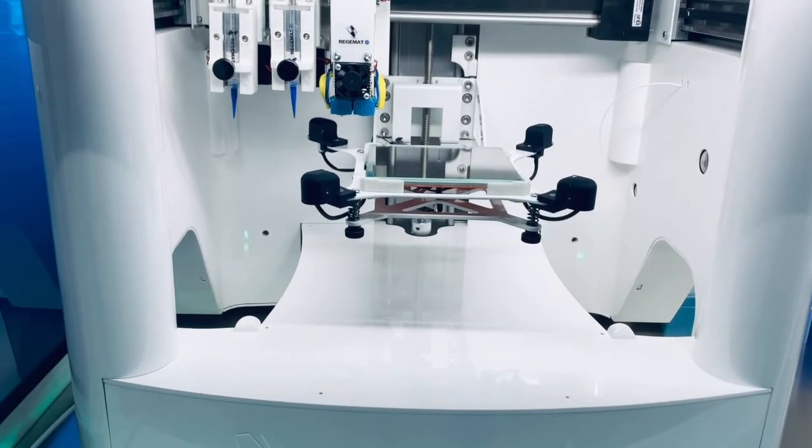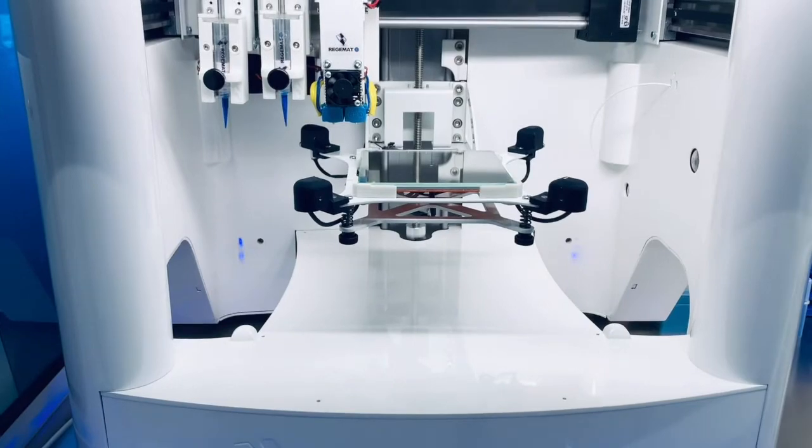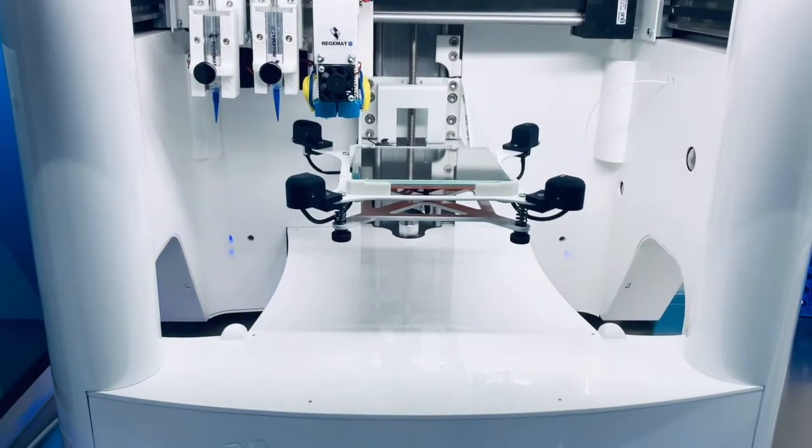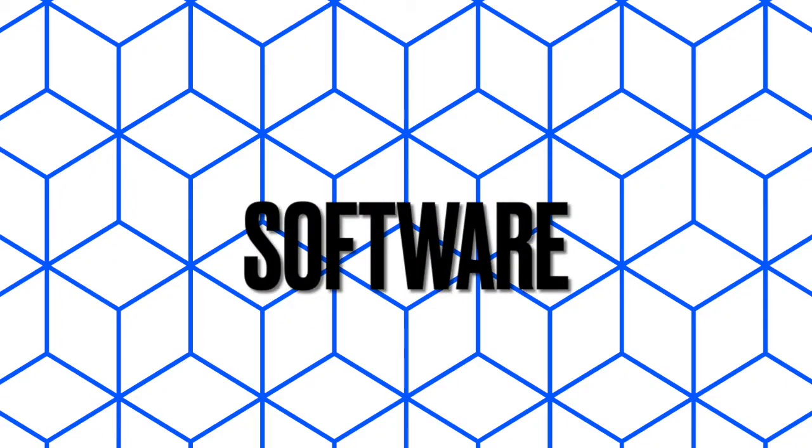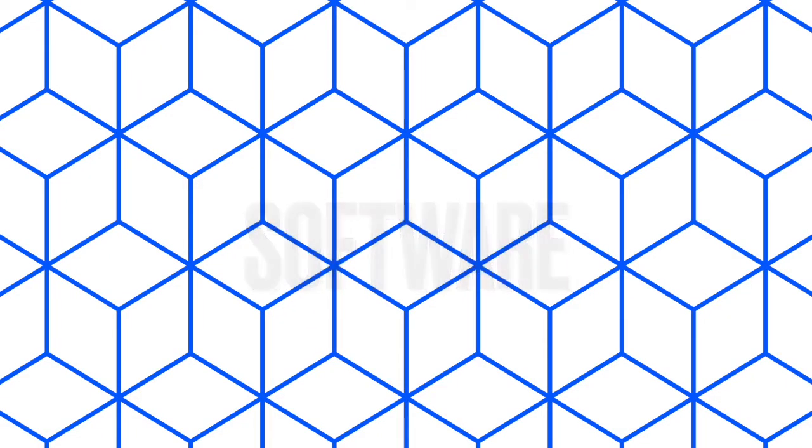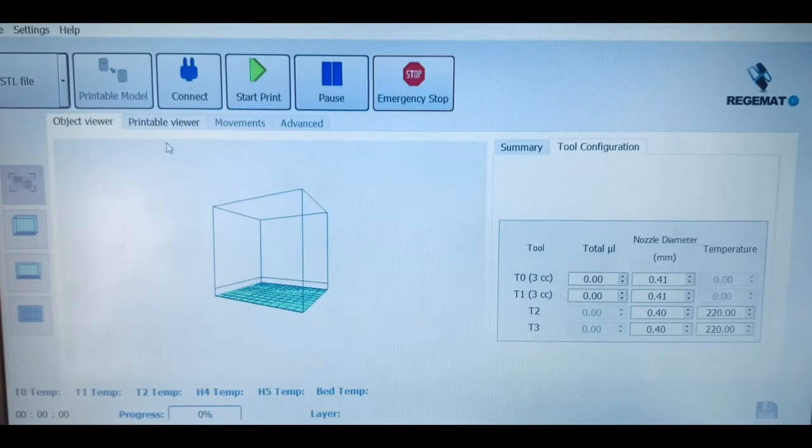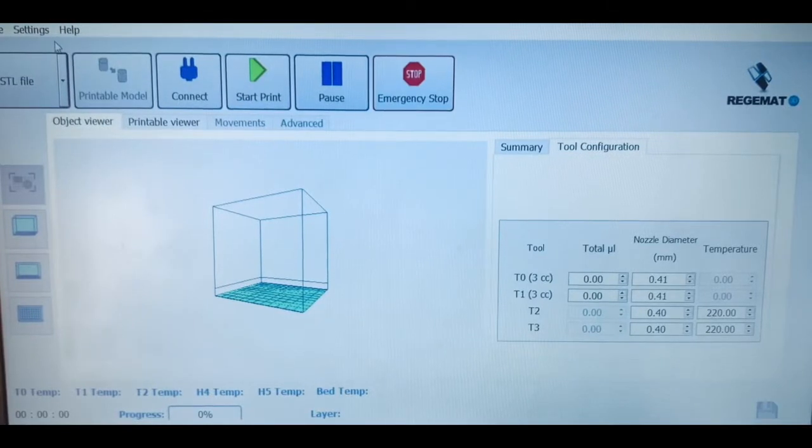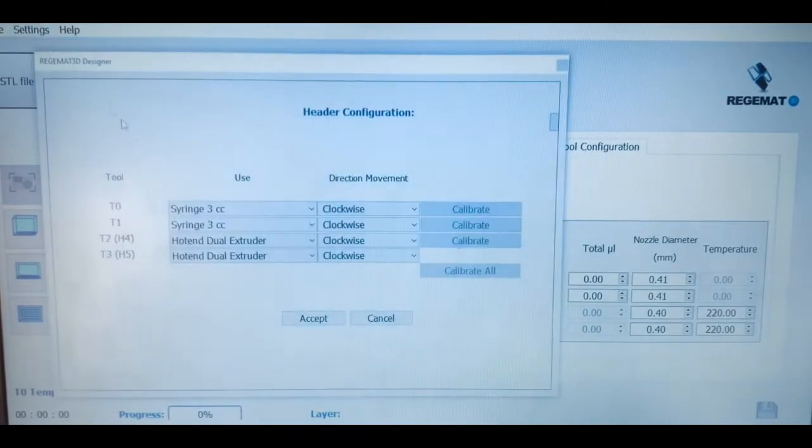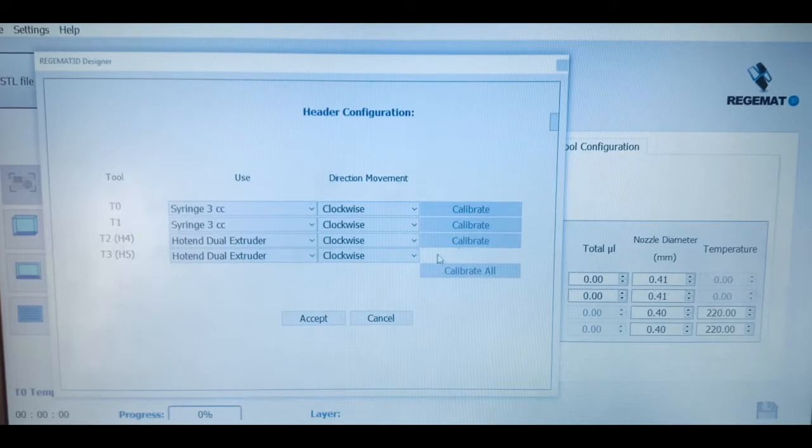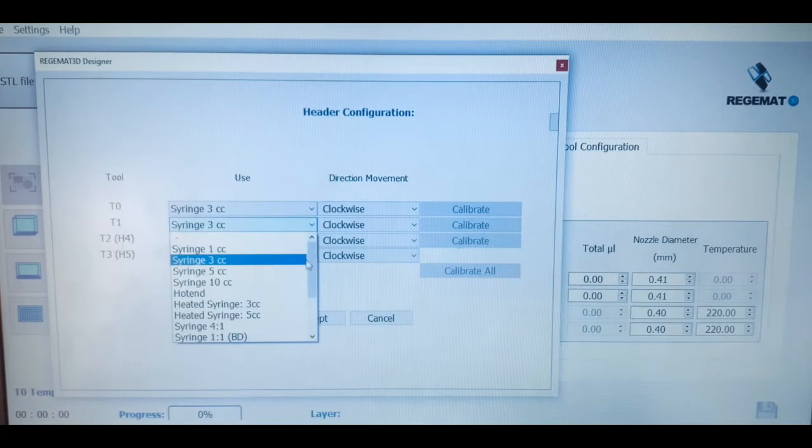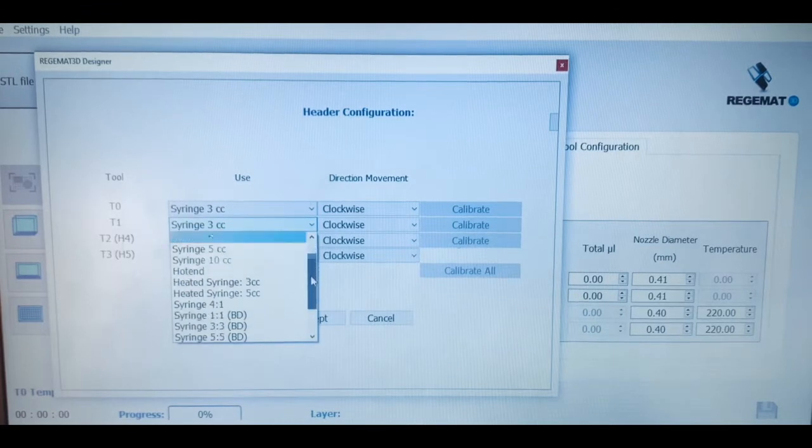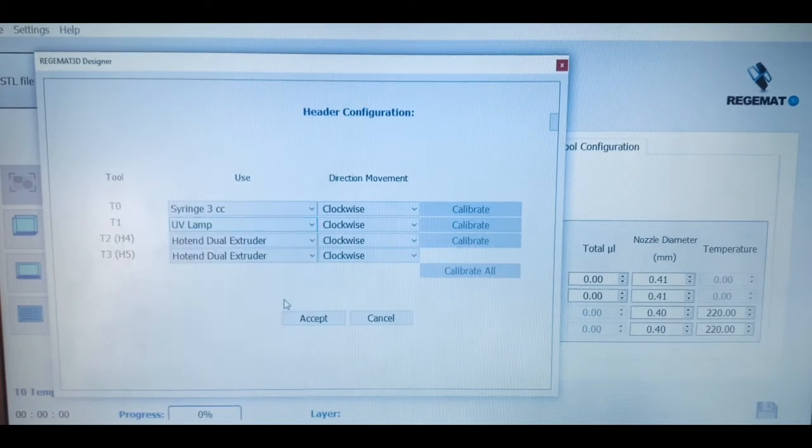The bioprinter comes with the new version of our intuitive but advanced proprietary software, which can be also adapted to the needs of your research projects. With this software, you can select and control each of the bioprinting parameters. The first thing is to define the printing configuration by selecting the tools we are going to use in our printhead, as for example, 3ml syringes and the UV light.